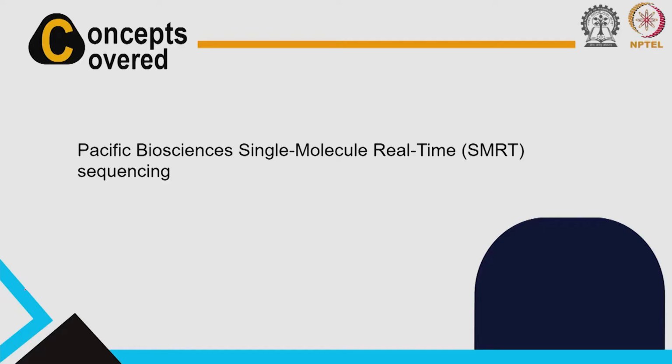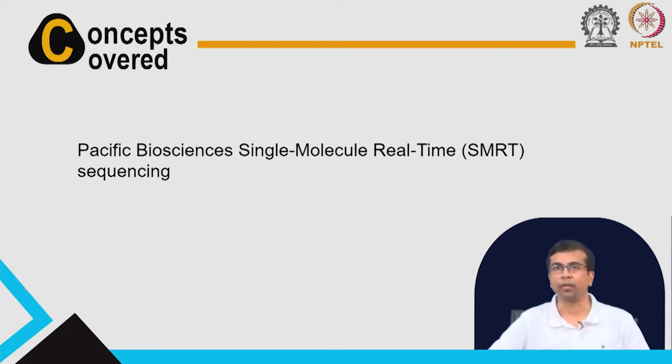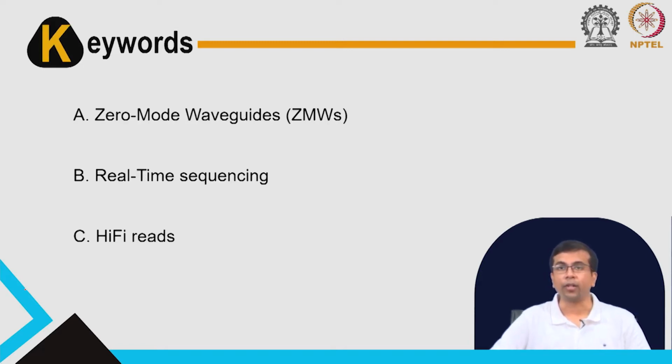So, this is the topic for today's class. We will discuss the single molecule real time sequencing method developed by Pacific Biosciences. These are the keywords that we will come across. We will have zero mode waveguides or ZMWs, we will see the term real time sequencing quite often, and finally, we will also see something called HiFi reads in the presentation.